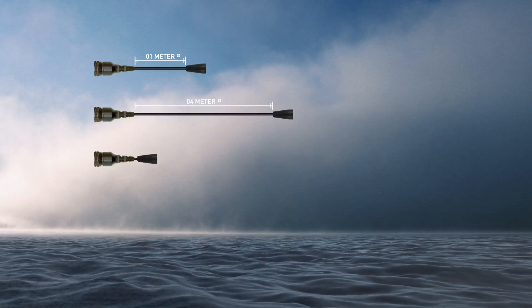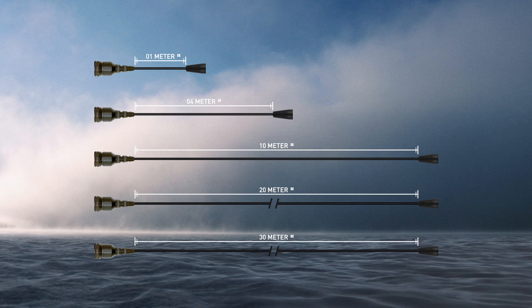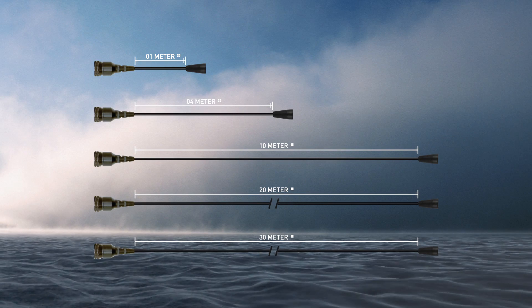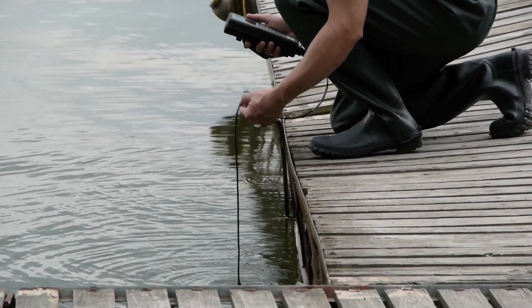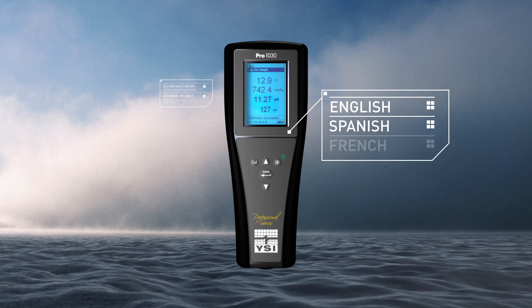Available with 1, 4, 10, 20, or 30-meter cables. 4-meter and longer cables include a cable management kit. View display with polarized sunglasses on. Multiple languages include English, Spanish, French, and Portuguese.